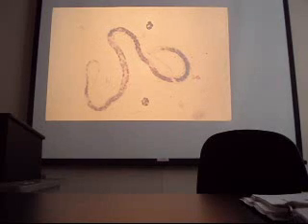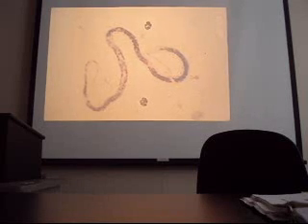How low can you go? Okay, this is Brugia malayi. Look at its sheath. Here's part of it. And then we got the tail. The tail has a terminal nuclei and a subterminal nuclei. So that's Brugia. It also causes elephantiasis, and the mosquito is the one that carries this.